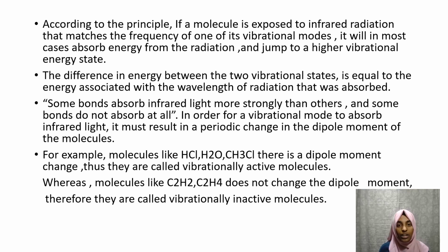The difference in energy between the two vibrational states is equal to the energy associated with the wavelength of radiation that was absorbed. Some bonds absorb infrared light more strongly than others, and some bonds do not absorb at all.